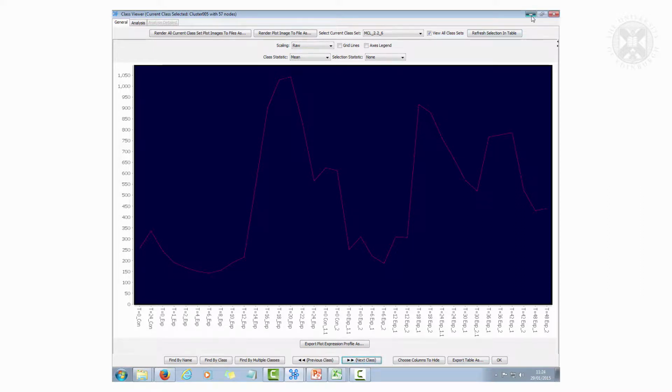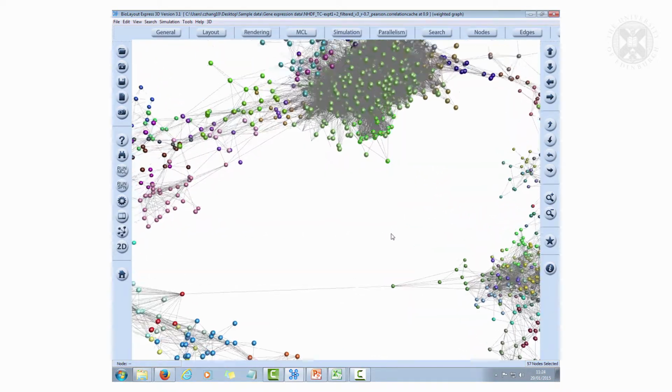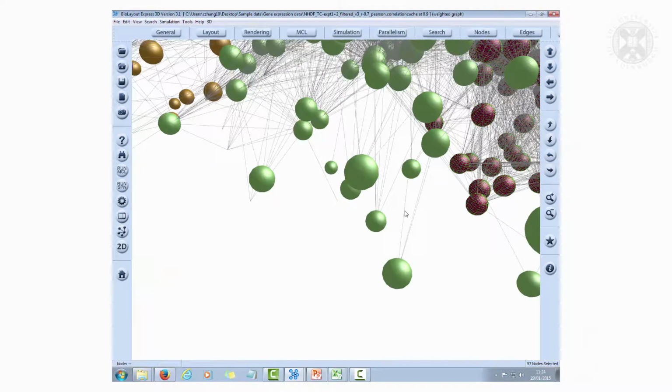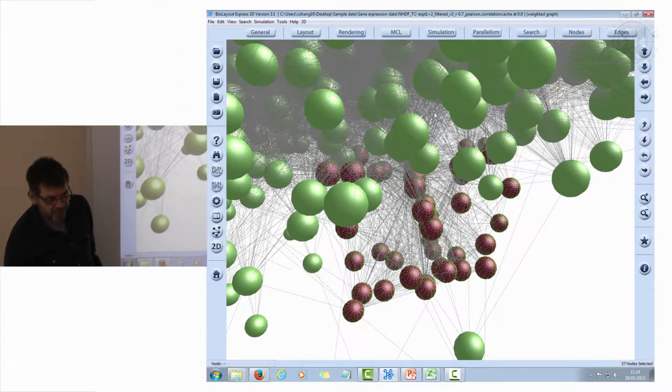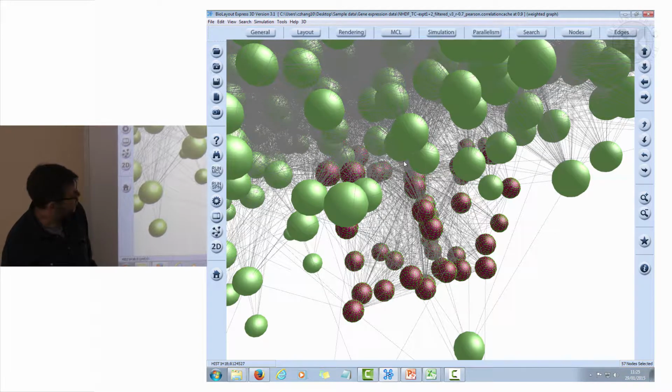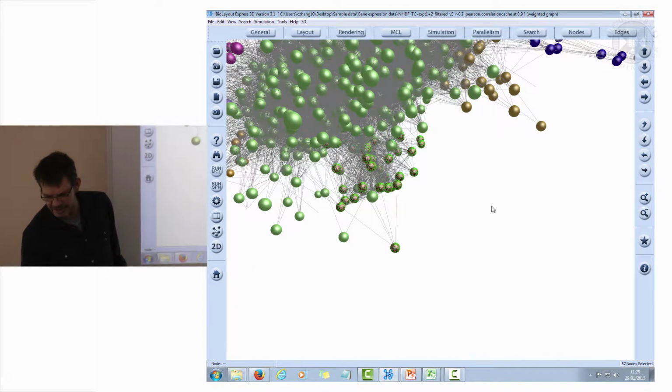And actually I know what these guys are. Where are they? Okay, see them there. They're related to what was cluster 1, the biggest cluster going up. These ones are just sitting on the side, sitting proud. So they're related to that, but they're not the same.